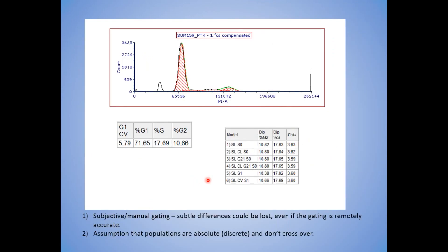All right. Let the model do the work. Now, I know there are other resources out there. I'm on DNA cell cycle analysis. Multicycle in FCS Express has six different models. And you're supposed to actually do your main control one, your main control file, and choose the model that has the lowest chi-square so the data is as clean as possible.